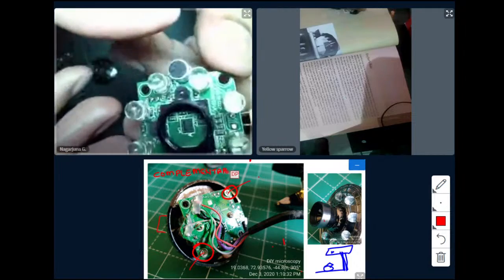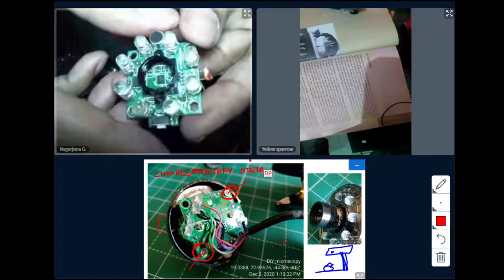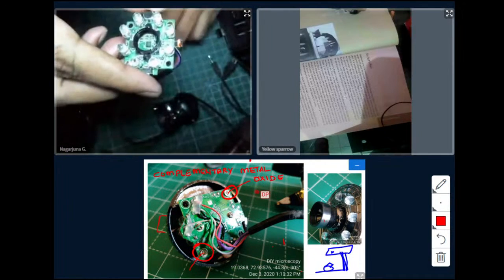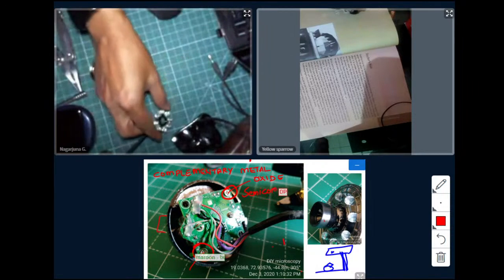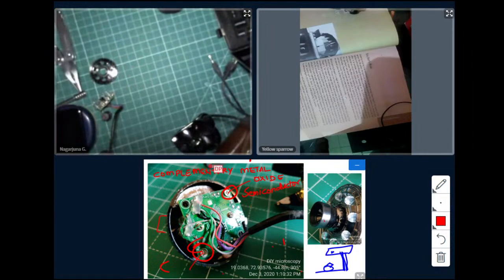It's complementary metal oxide semiconductor. Okay. So now I'm going to show something important related to the webcam. Just 1 second. I think CMOS is just like the retina in our eyes.